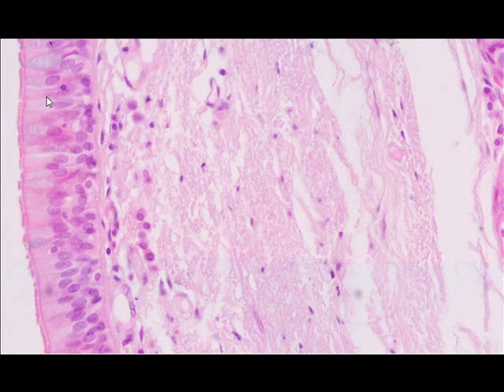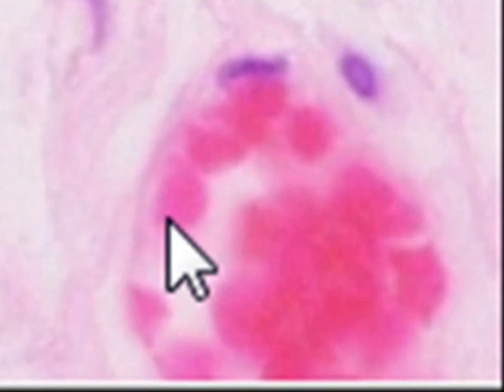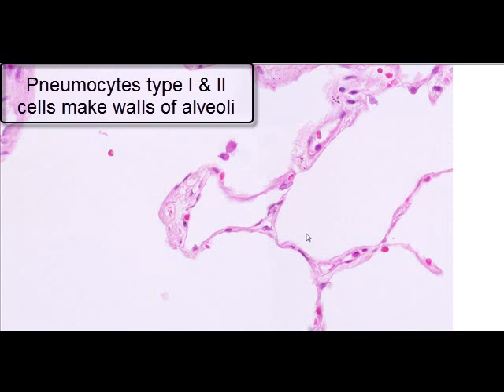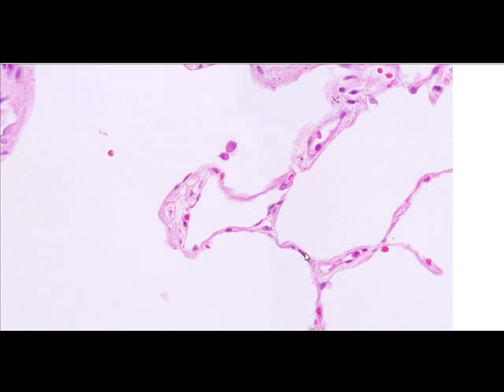Cytoplasm appears pinkish because most of its proteins are basic in nature, meaning cytoplasm has a pH of more than 7. Connective tissue is visible in this area and usually appears as a pinkish band of tissue with bluish nuclei within it. A blood vessel is visible with red blood cells in it — red blood cells do not have nuclei; they are anucleated cells and appear red. In the lung tissue, you can see flattened nuclei of type 1 pneumocytes along the alveolar walls, while type 2 pneumocyte nuclei are rounded in shape.